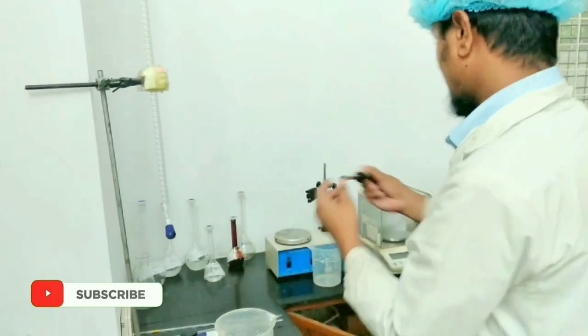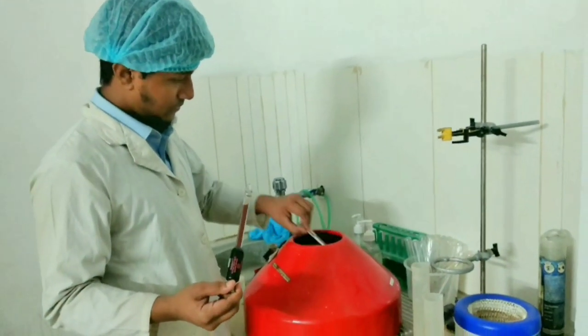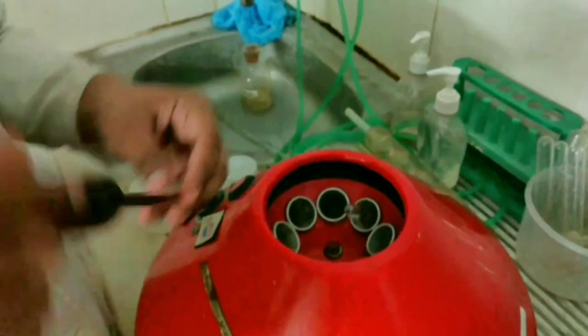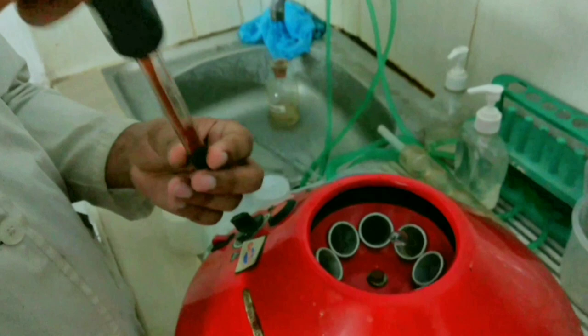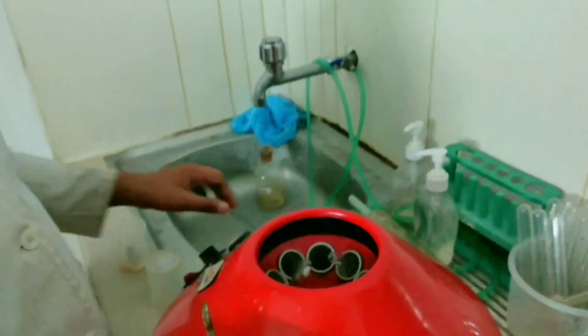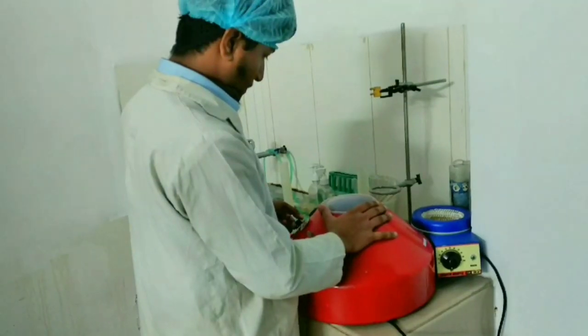Then heat the tube in a water bath for 5 minutes. Now centrifuge the tube at 1100 rpm for 5 minutes. Start the centrifuge and set the tube at 1100 rpm.